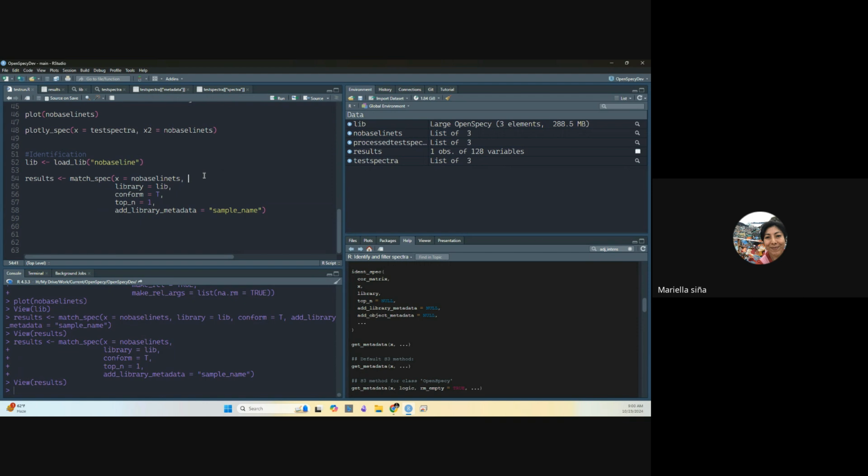Oh, just before you close, I have a question. When I was trying out the Open Specy app, I put in some spectra that, I think maybe because they were too similar, an error came out, and I just wanted to confirm with you. The error said features cannot be all true or false, because that would indicate that there are no distinct features.